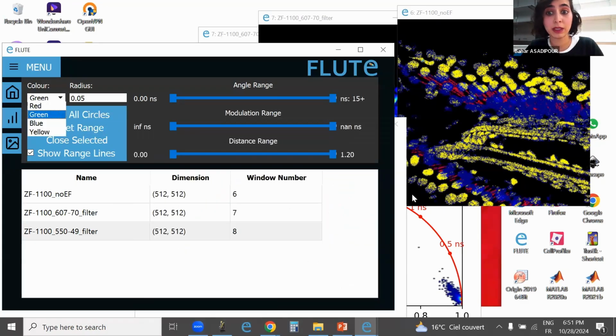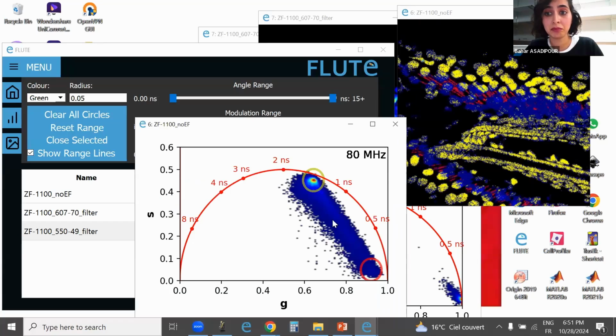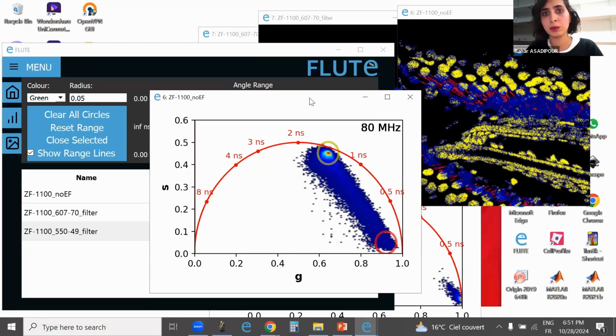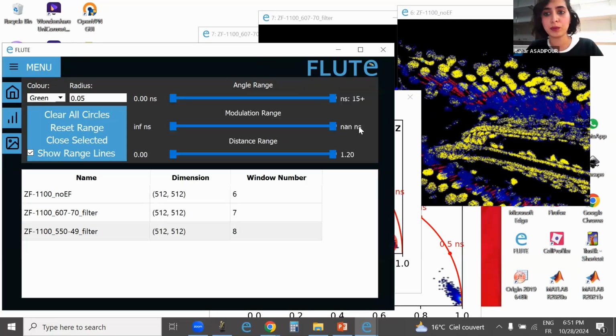Okay, so it's not responding to me. Do you recommend our calibration file, the fluor, to have the same excitation emission spectra as the label-free signal we are expecting from our... Yes. Especially if you're collecting with different detectors, you have to calibrate for each and every one of them, so it would be of use.